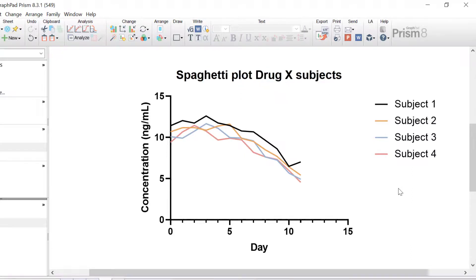In this video tutorial you have learnt how to create a spaghetti plot in Prism. A spaghetti plot is a type of line graph that commonly presents longitudinal data showing individual traces for each subject or another experimental unit. There are two ways to plot a spaghetti plot in Prism: either by colouring the lines according to the experimental group, or colouring the lines by the individual replicates in a single group.